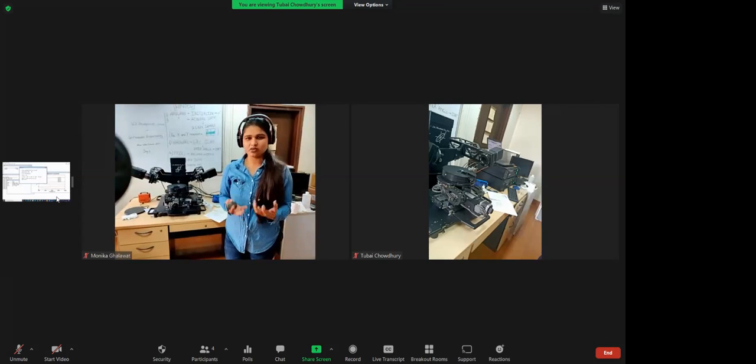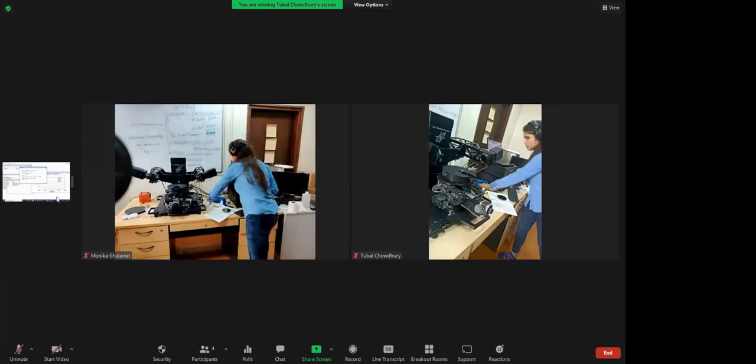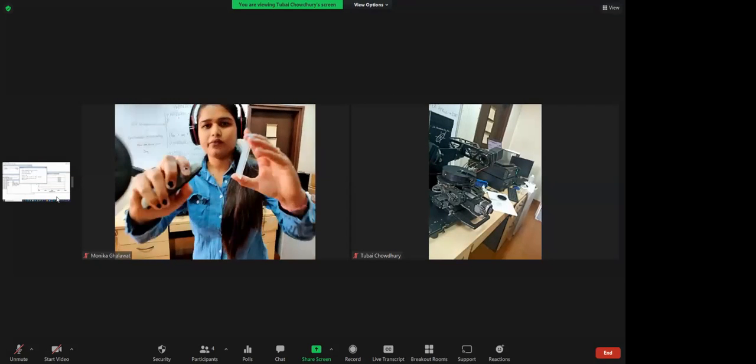Please repeat one more time how the laser is fitted on the sample. Okay, this is a simple laser we generally use in our lab. So this is a glass substrate. What you have to do is just check. This is not optically smooth because its transmission is there.